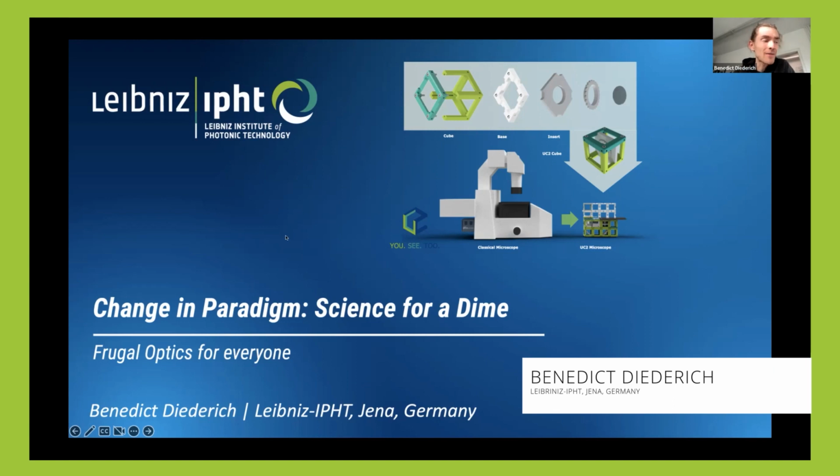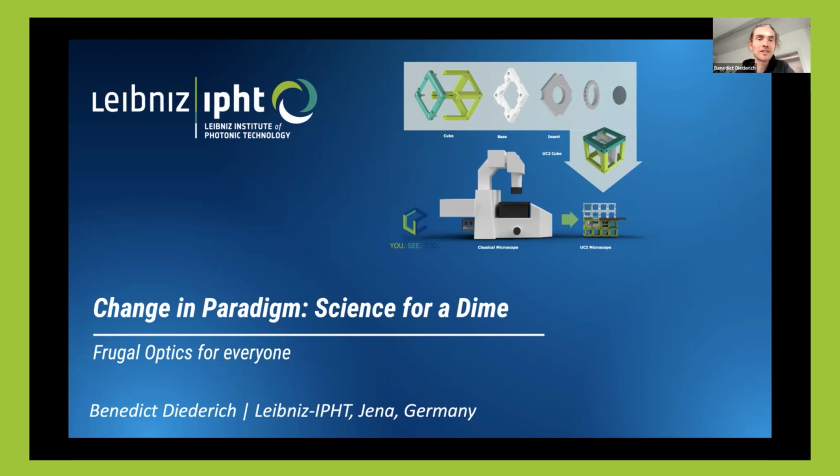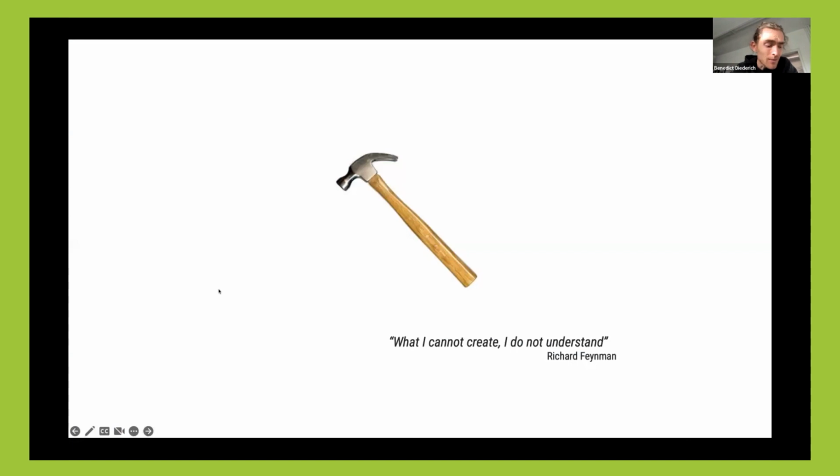Right now is maybe the best proof that open source microscopy is useful, because I'm not in Jena, but I'm assembling a microscope together with some other people remotely. Our mission in a way is making microscopy as simple as the tool you can see here, which is essentially a hammer. My mission is that I have to understand everything, so we build Storm, SIM, and all kinds of other things. And yeah, this is really fun.